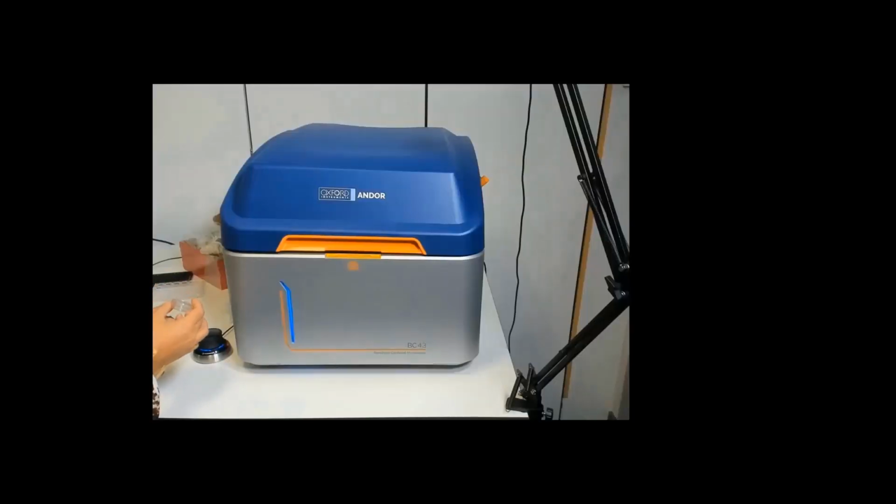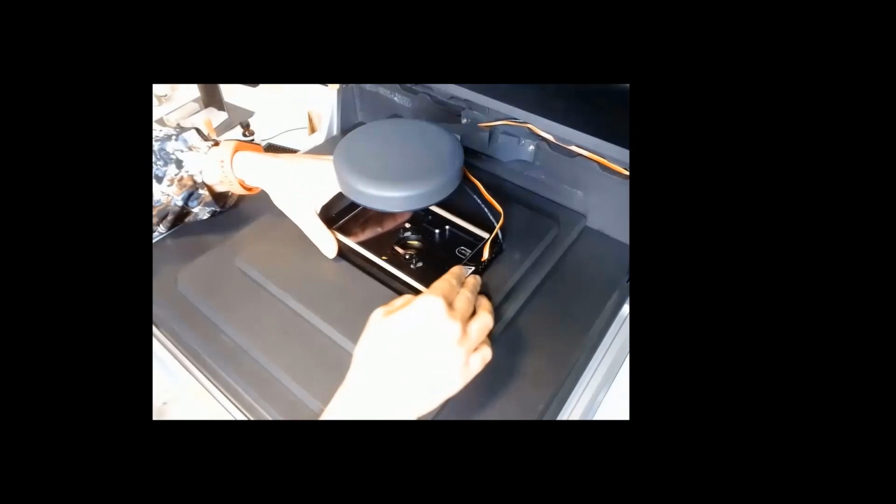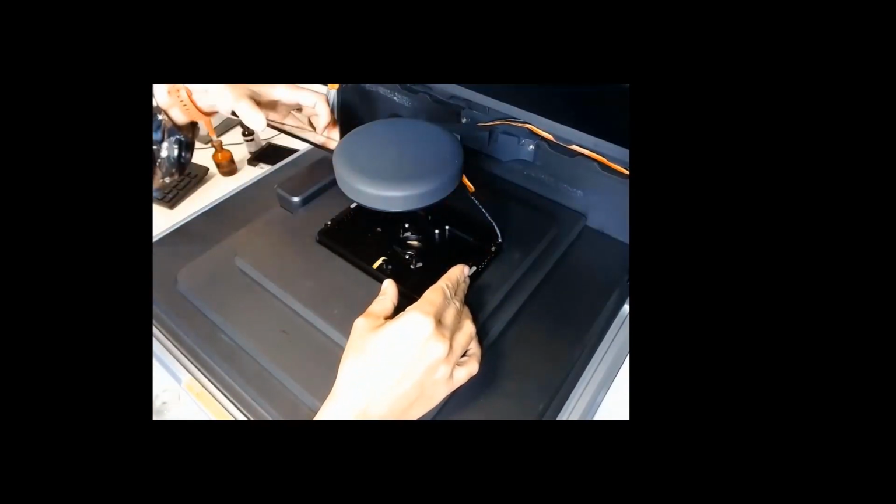So I will now add this glass bottom dish. It has no sample, just for better orientation. I made a cross so we can find it and focus it while I'm going to add oil. Open the lid of the microscope. You slide the lid away.